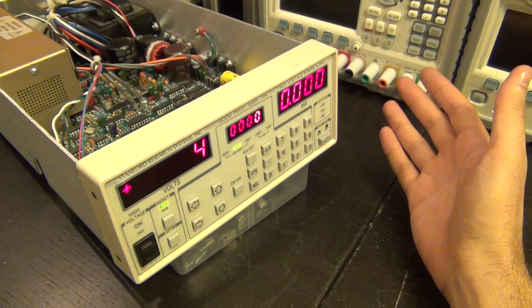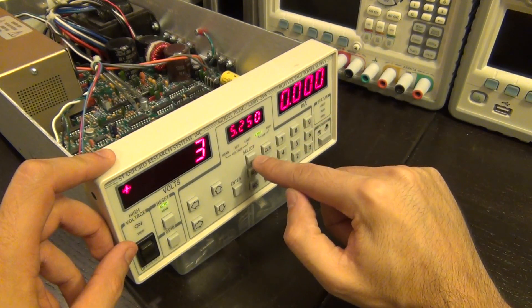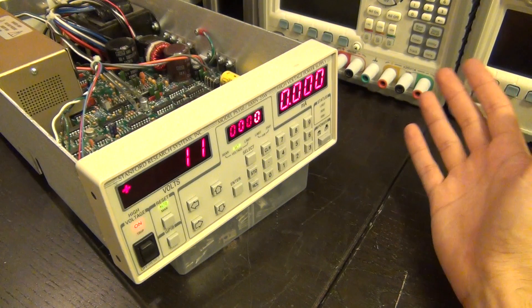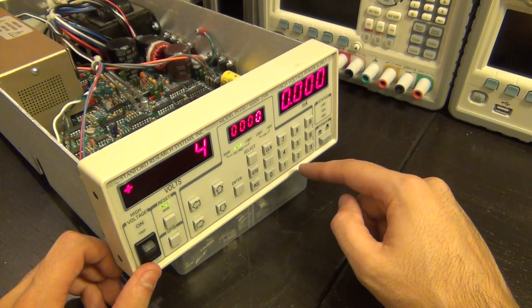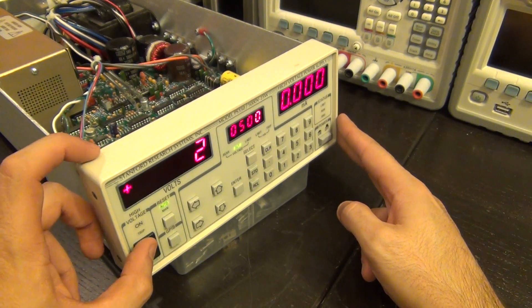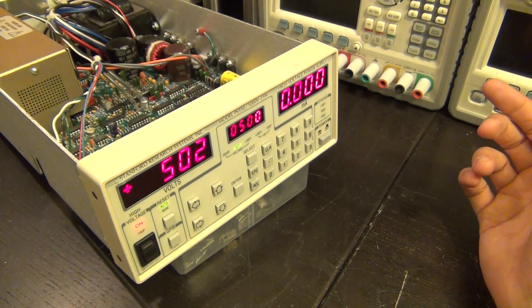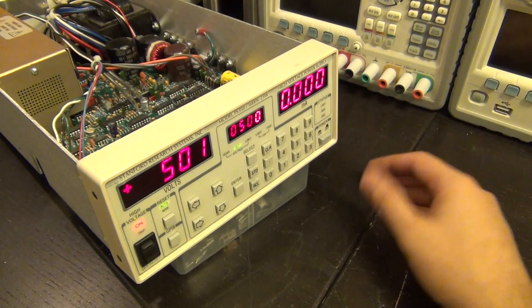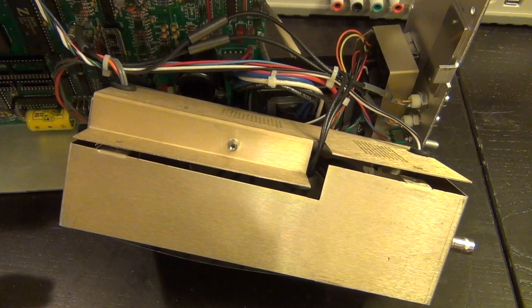Powering it back on — look at that, it no longer shows 2,466 volts! It's now reading correctly. Setting it to 500 volts and enabling the output — 501, 502 volts — I can't believe it, it came back to life! That was the only issue. I haven't measured the output yet but it's far more promising than before.